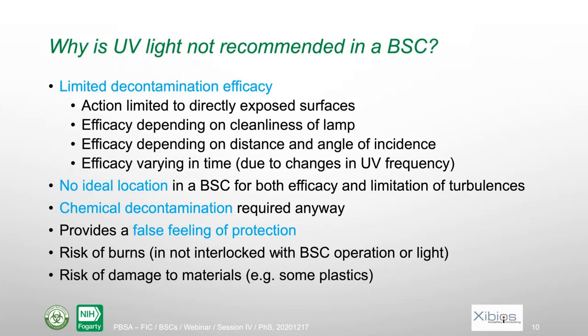The next question is about UV light. Why is it not recommended in a biosafety cabinet? I briefly answered that at the end of a session. Still, I want to point out the main reasons. First, the efficacy is limited. It's only limited to exposed surfaces. So something which is hidden behind something will not be exposed to the light.